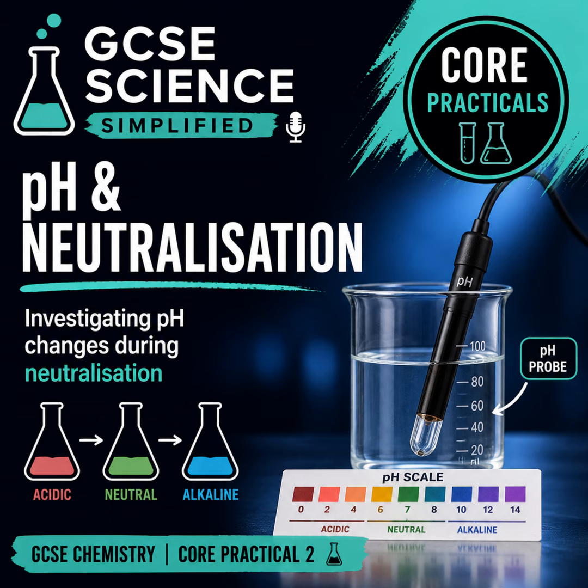So, at the start, the solution is acidic. We have a low pH. It's red. As you add calcium hydroxide, the pH rises. Then, something important happens. The pH reaches 7, or neutral. This is when it's green. But you don't stop there. You keep adding that base. The solution becomes alkaline. The pH rises above 7, it becomes blue or purple, and this tells you you've gone past neutral. The base is now in excess, or too much.